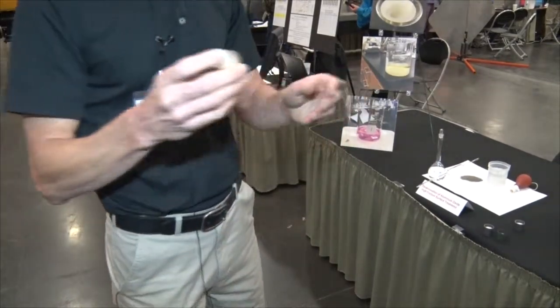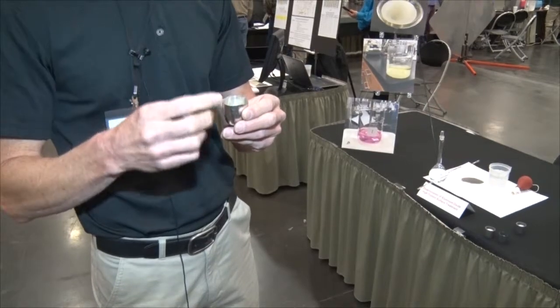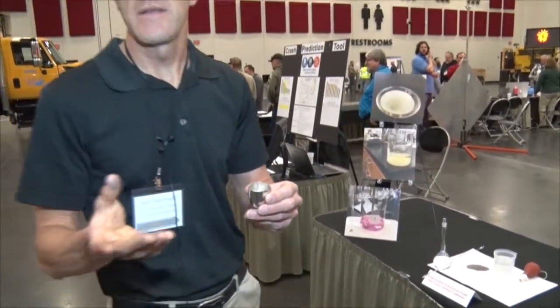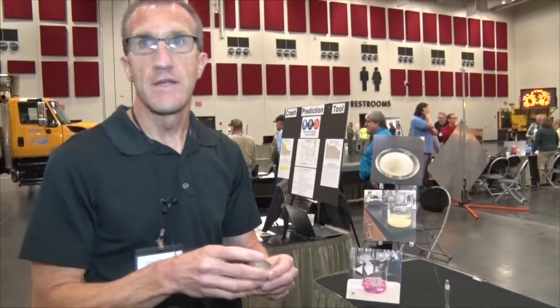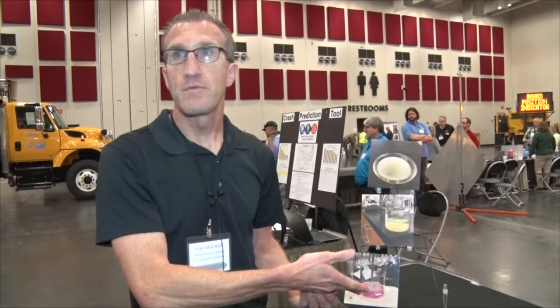Once I've done that, I take the weight of this crucible, and then I compare that weight to the original sample weight, which was 0.05, and I get what they call a percent recovery. So say I have a percent recovery of 100%. I had 0.05 grams in that crucible, and I had started off with 0.05 grams. I have 100% of aluminum, iron, phosphorus, titanium, and silica.